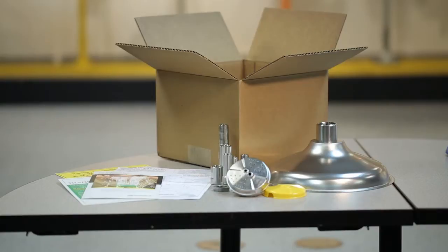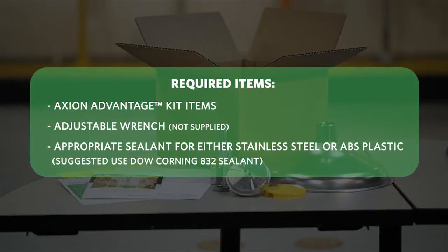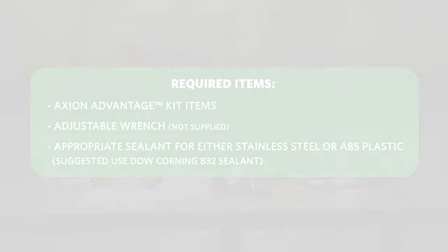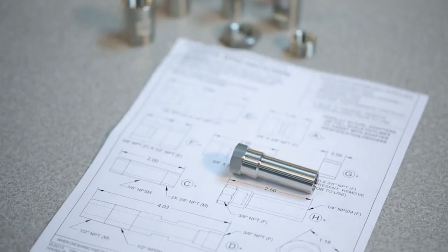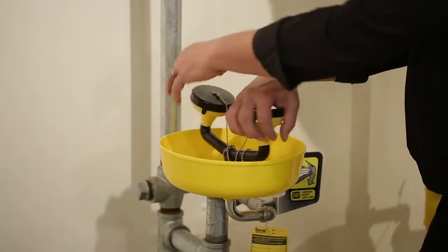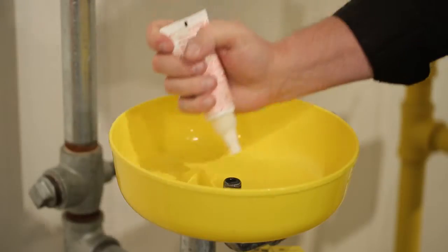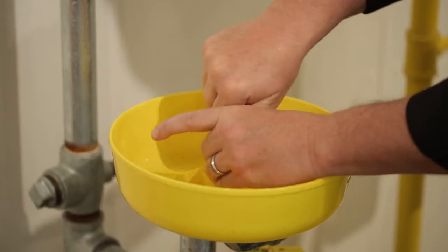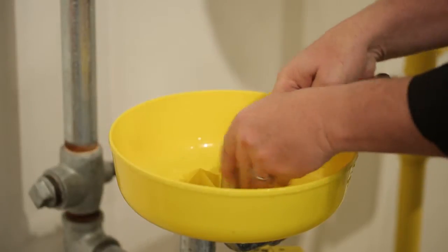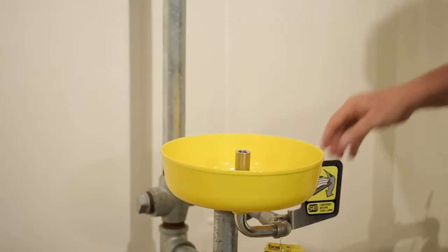Transforming your existing emergency equipment to AXION MSR technologies is simple. To start, you need the pieces from your AXION Advantage kit and an adjustable wrench. Determine the appropriate adapter needed by referencing the install menu. Remove your existing eye wash assembly from the bowl and strainer by turning the piece counterclockwise. Apply appropriate sealant to the strainer and connect the correct AXION Advantage adapter to the bowl and tighten using the wrench.